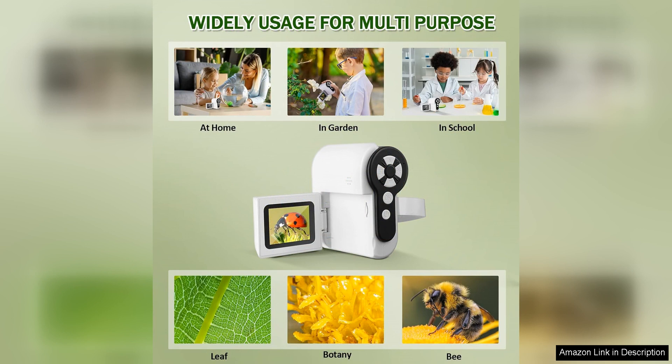Overall, Barkron's microscope for kids is a fantastic educational tool that will inspire young minds to delve into the fascinating world of microscopy. With its high magnification level, adjustable LED lights, and user-friendly design, this microscope is sure to provide hours of fun and discovery for children of all ages. I highly recommend this product for any young aspiring scientist or curious explorer.